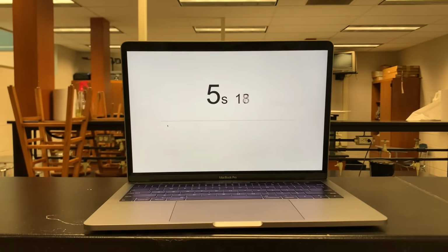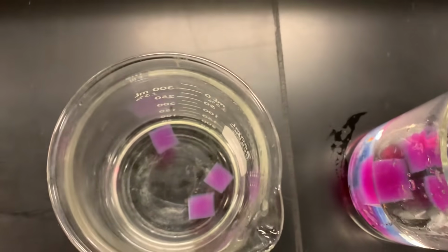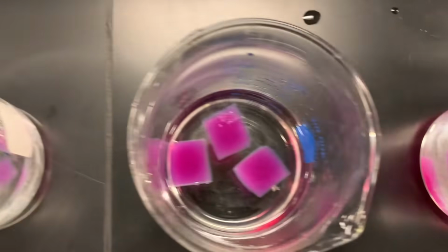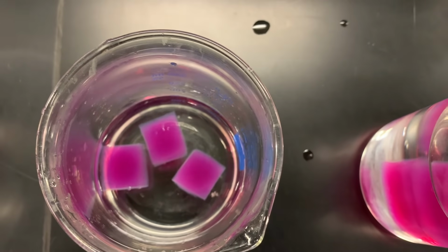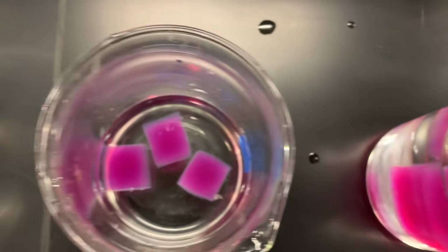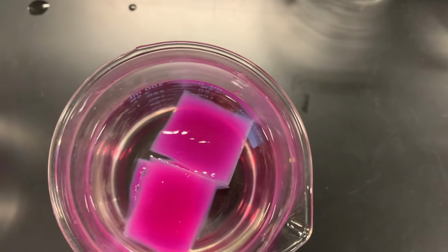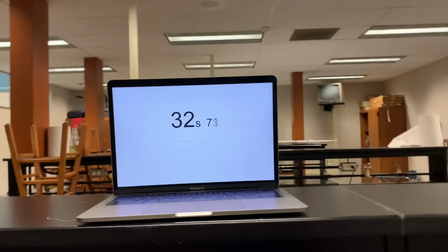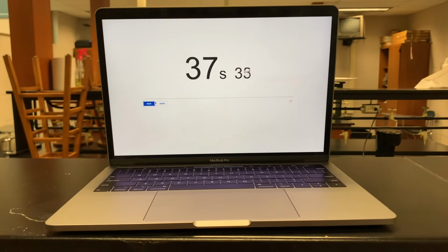I'm going to observe them. And what's going to happen over time, you guys can see here for the 1s, you can see the outside is slowly starting to become clear while the inside is not. Same thing with the 2s. You can see the outside slightly clear around the edges of the cube. The insides are completely pink. And then our 3s, they're slightly clear on the outside, not too much. Okay? So we'll wait about 5 to 7 minutes, guys, and I will come back and show you what happened to them.